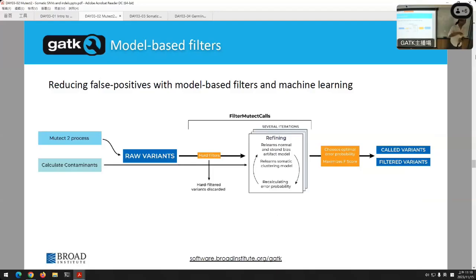What if I make another tweak over and over, using different aspects of it until we finally have confidence that there are no obvious changes we can make that'll make the overall confidence in the call set higher. This is the last step of refinement that will help us figure out what other bits of it we have to cut away so we are confident in the whole. It will also cut down the set of variants that we actually have left, though. But that's okay. We'd rather undercall than overcall in this particular case.